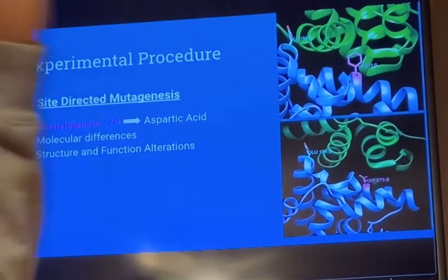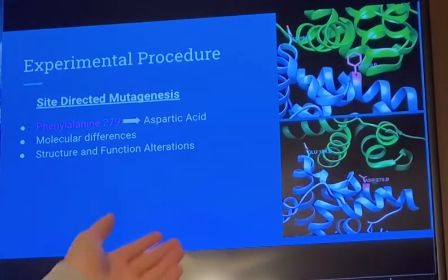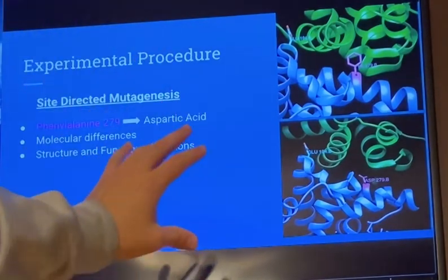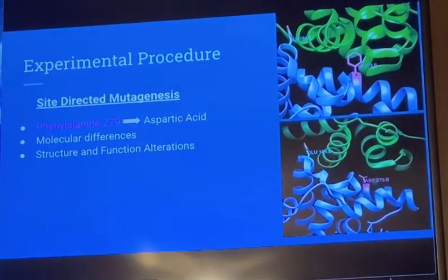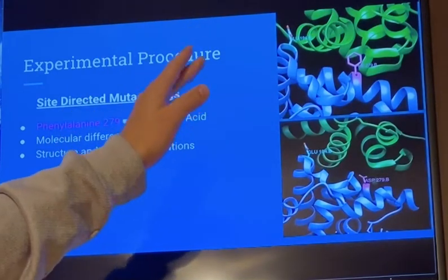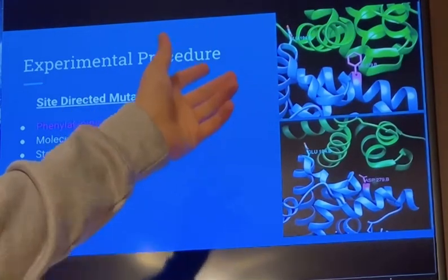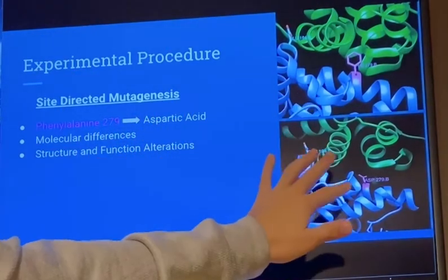So we're just looking at what we do know, what we don't know. The information gap is, we know a lot about KPR in E. coli, but we want to learn more about KPR in Staph aureus. And as you can see, we're gonna play around.